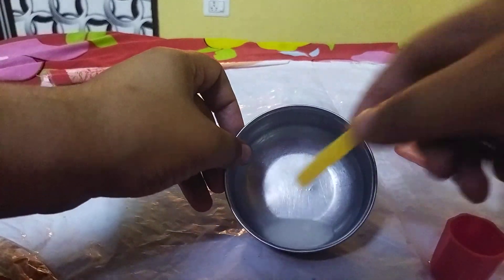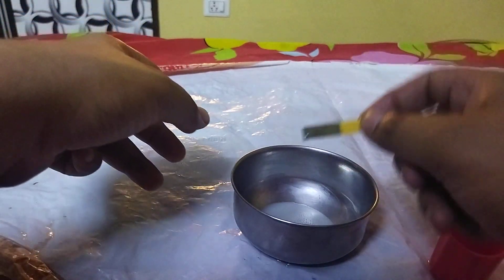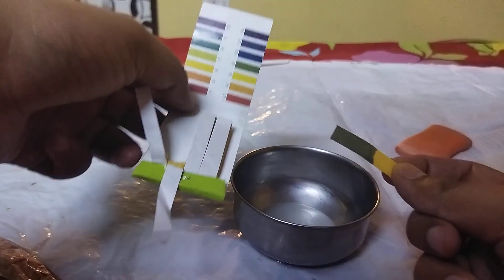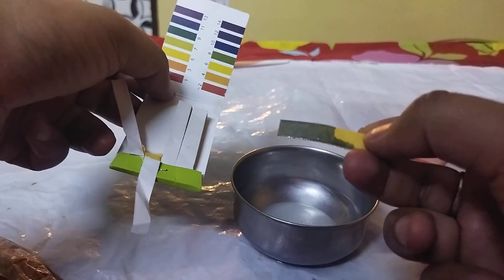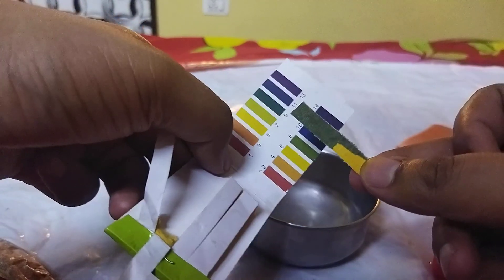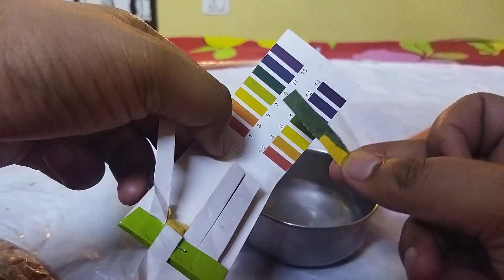Let me pull out a strip of the pH paper and dip it. Wow, it is dark green in color — not slightly green — it is dark green, and it is slightly basic. You can consider it to have a pH of 9; it is a perfect match with 9.